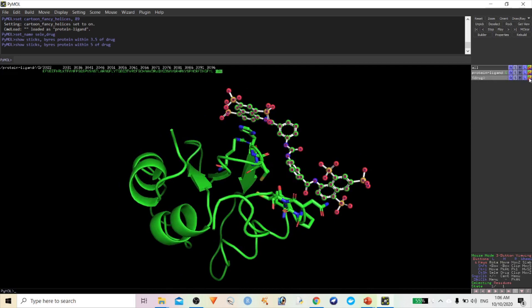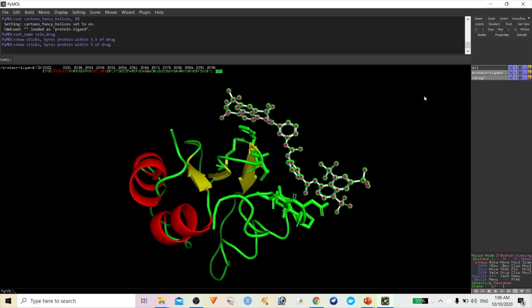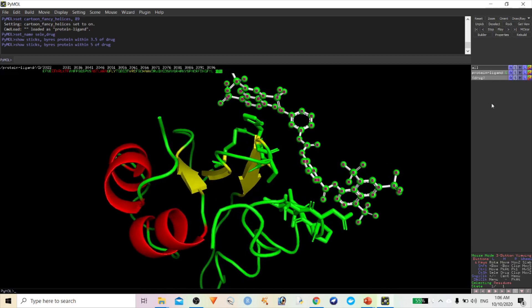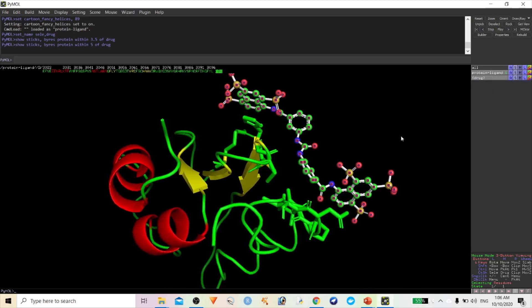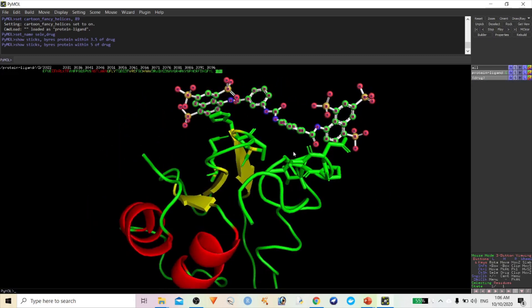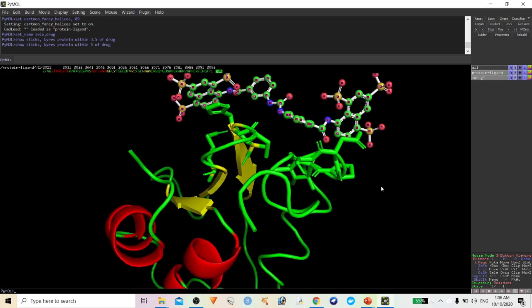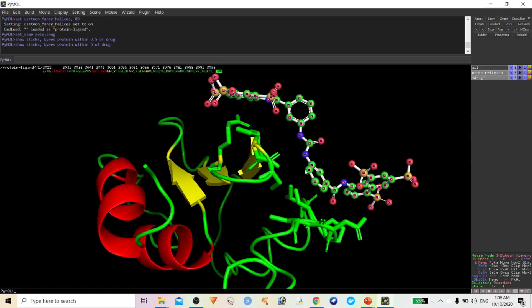We can give different colors as well. I'm going to color by atom. So here I selected this ligand molecule and also the 5 angstrom distance amino acids from the drug molecule.